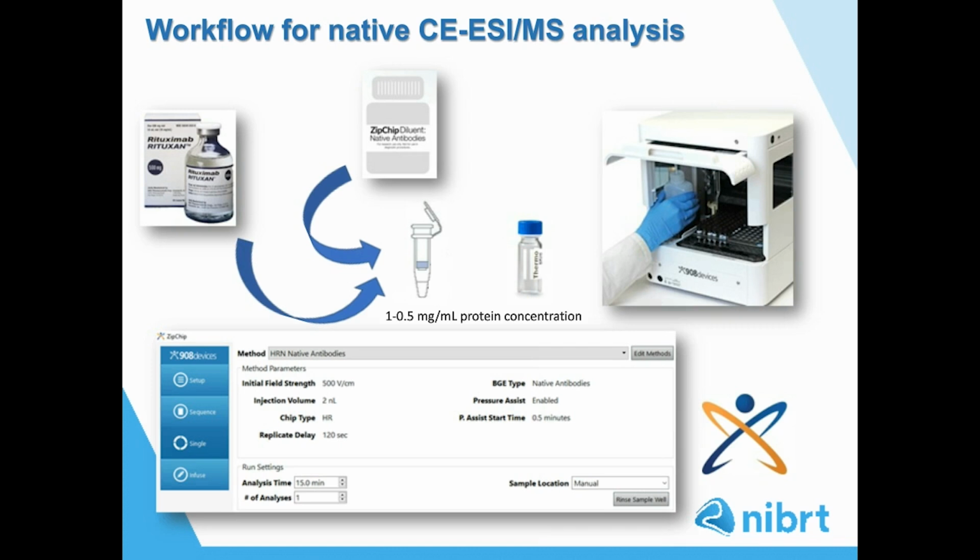We choose to perform the analysis for 15 minutes to give time to the sample to be completely pushed through the microchannels, and found that these settings worked well with all the monoclonal antibodies that we tested so far in our lab. It is worth mentioning that the sample concentration used in this experiment translates into only 1 nanogram of protein injected, and this makes this platform ideal for samples with limited availability.